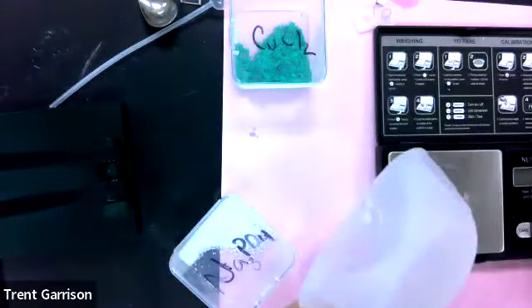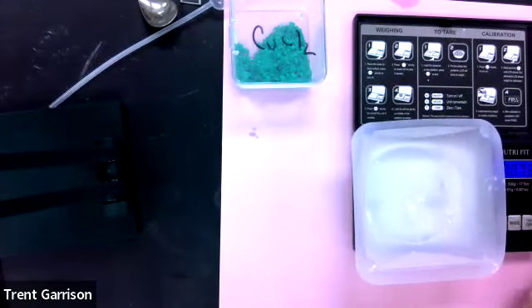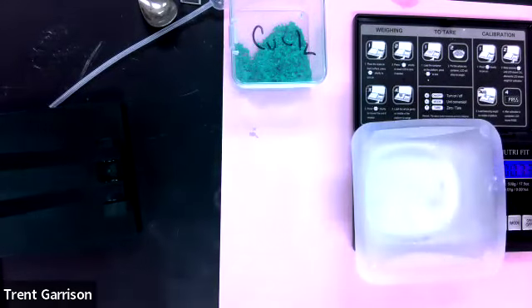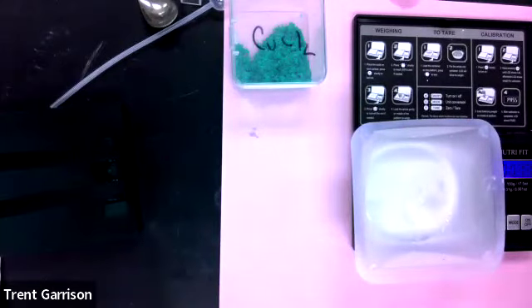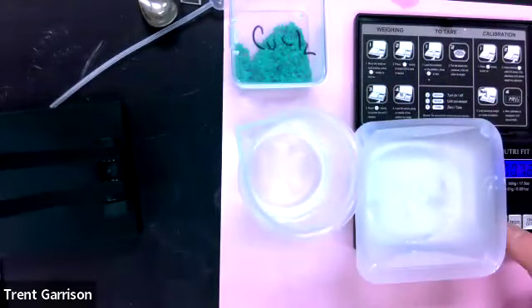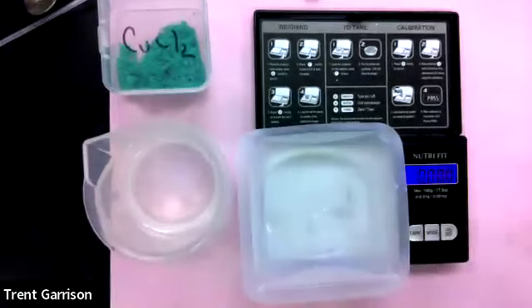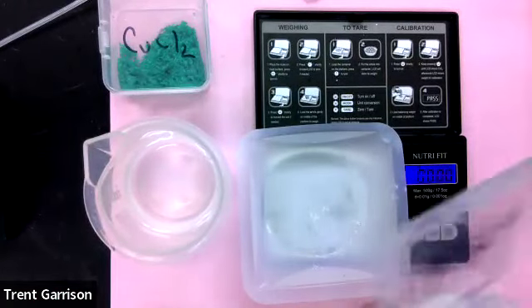All right, so let's first take 1 gram. So let's weigh out 1 gram of both of these here. And the 1 gram is nothing specific. We're just getting a starting point so we can have similar measurement amounts. And what we're going to do also is dissolve this into 50 milliliters of water. So I've got my measured 50 milliliters of water right beside me. I'm going to tare the weight there. So let me bring my camera so you can see it's not weighing anything. And we're going to put in 1 gram of the sodium phosphate, the white powder.